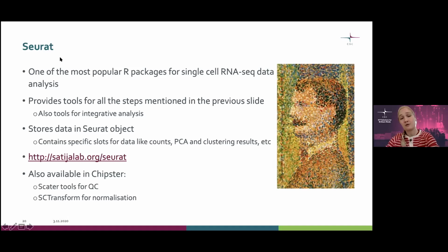Seurat tools are not the only tools that we have for single-cell RNA-seq data analysis in Chipster. We also have these Scater tools that can be used for quality control as well. And then we have these SCTransform tools for normalization as well.